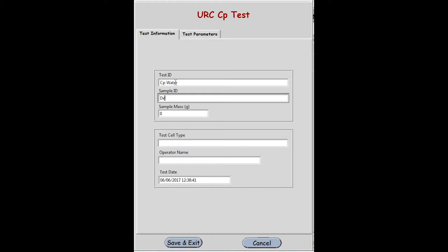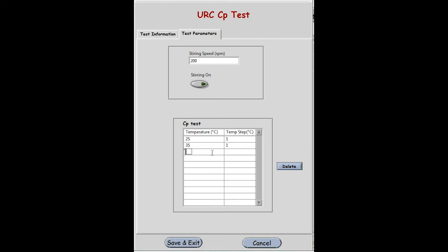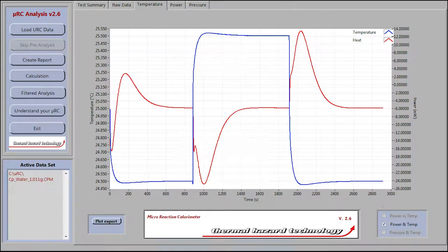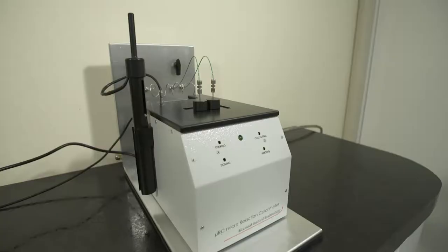The instrument quickly and accurately determines heat capacity with walk-away operation. Heat capacity at multiple temperatures can be measured in one experiment. Users simply enter experiment temperatures, sample weight and desired heat steps.